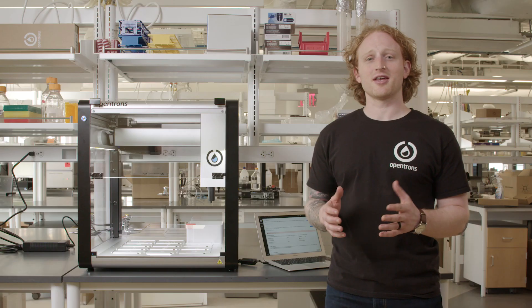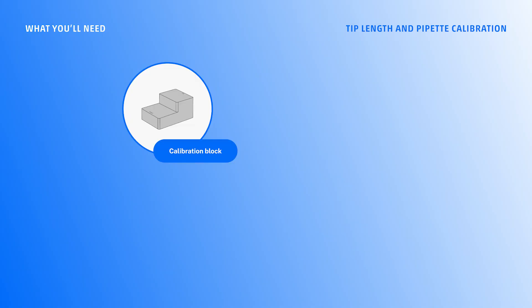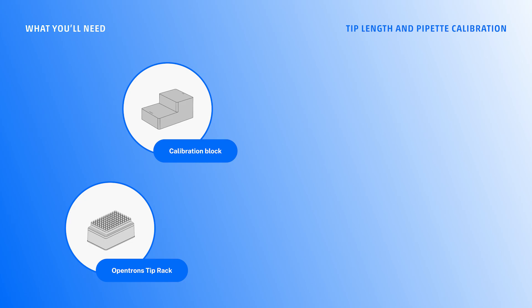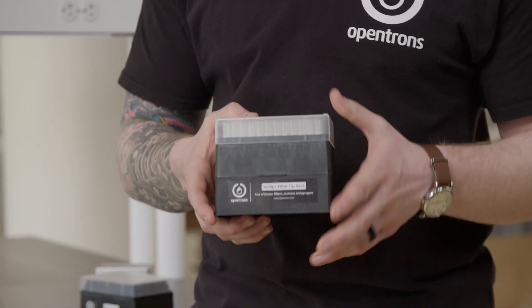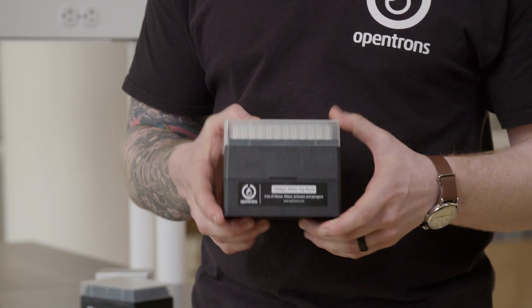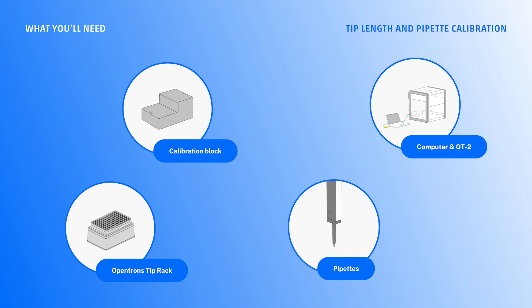For the tip length and pipette offset calibration, I will need the calibration block, the tip racks for my two pipettes — the P20 Multi and the P1000 single channel. I'll also need my computer and of course the OT2. The pipettes are already attached to the OT2, and I did that in a previous video.